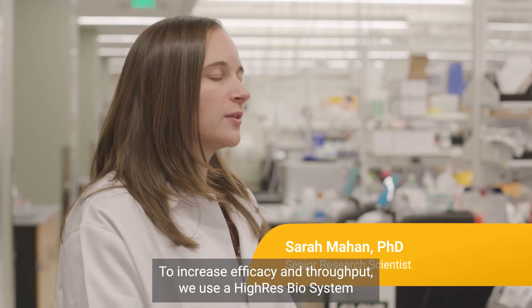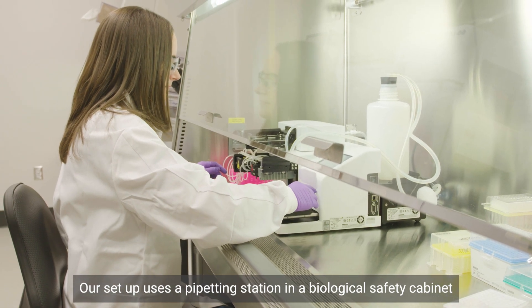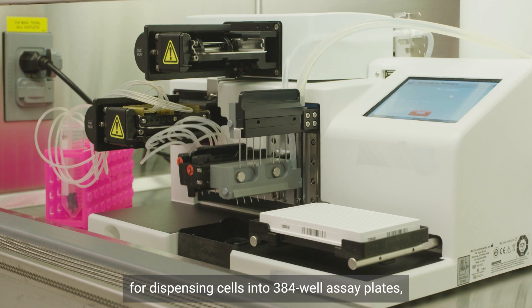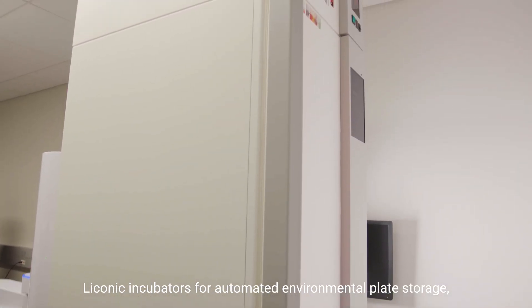To increase efficacy and throughput, we use a high-res biosystem to automate our workflows. Our setup uses a pipetting station in a biological safety cabinet for dispensing cells into 384-well assay plates, and Liconic incubators for automated environmental plate storage.